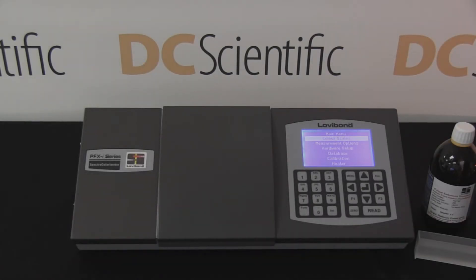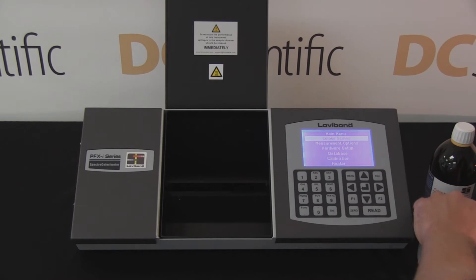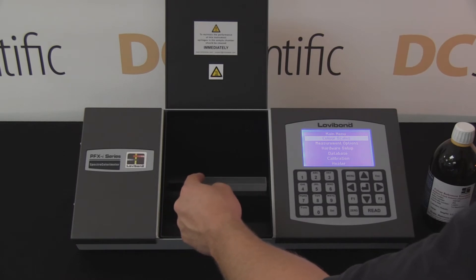To demonstrate the accuracy of the spectro colorimeter, the technician performs the test using an ISO 17025 certified standard with a Platinum Cobalt color value of 5.0, with an uncertainty of plus or minus 2 units.